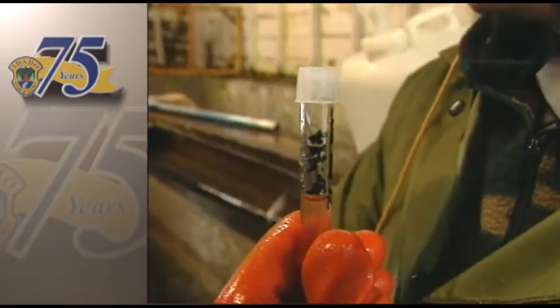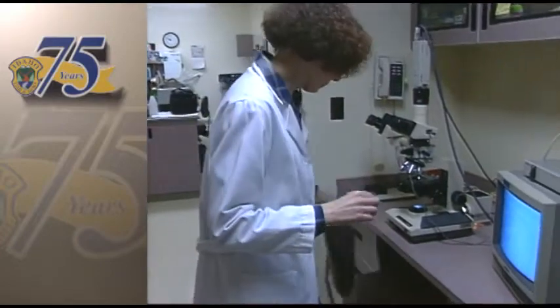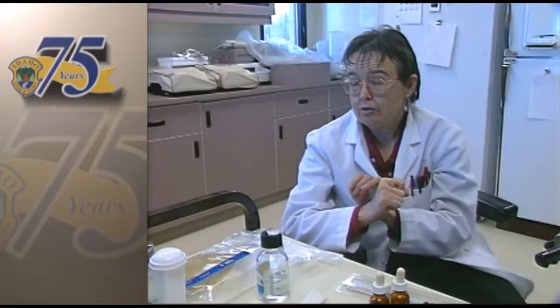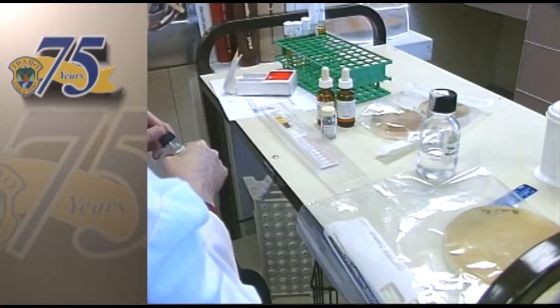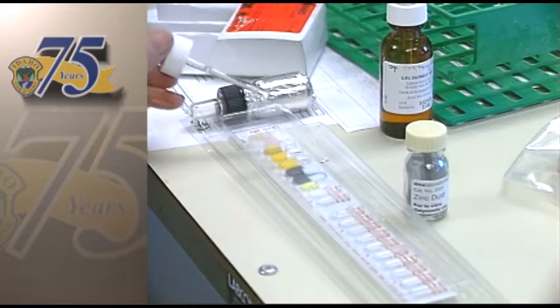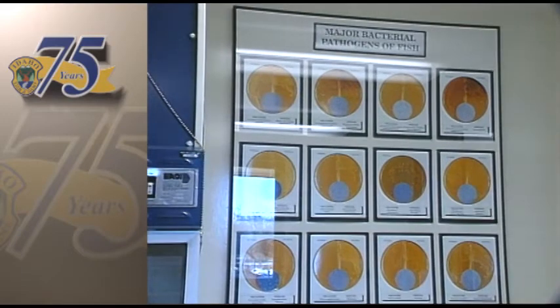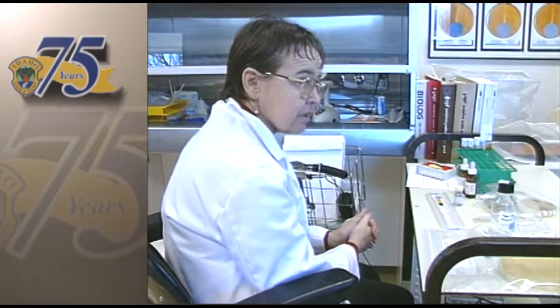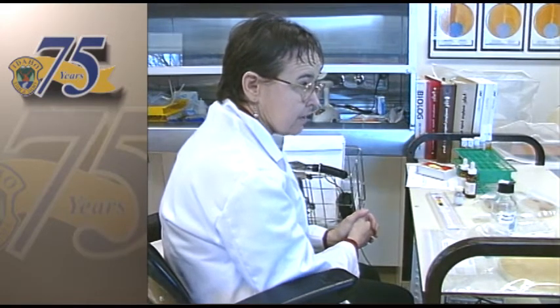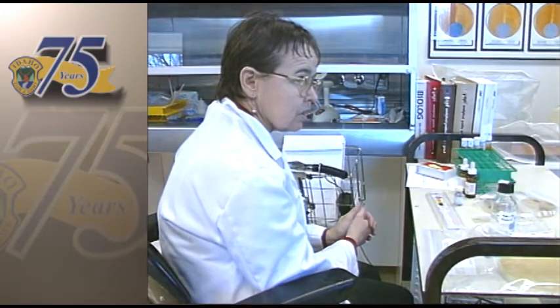For example, the test tube samples sent from the spawning cutthroat at Henry's Lake Hatchery will be tested here for things like BKD or bacterial kidney disease. It's a nasty little bugger. It takes 4 to 6 weeks at 15 degrees to grow. Once fish health technologist Sharon Wavra identifies a specific bacteria, she'll run more tests to determine what antibiotics will effectively treat the disease. Bacteria are funny little critters. They change, they mutate. As soon as you find a drug that successfully will kill this bacteria, he'll mutate, he'll change, and he won't be sensitive to that drug anymore.